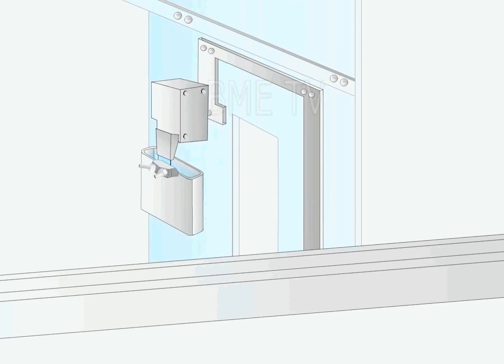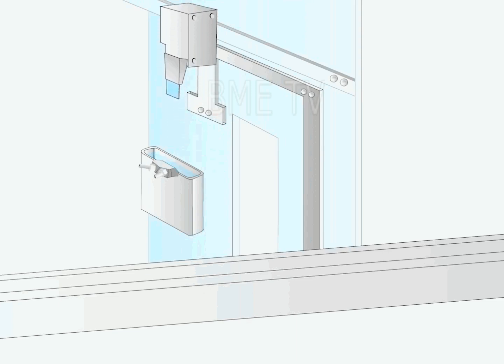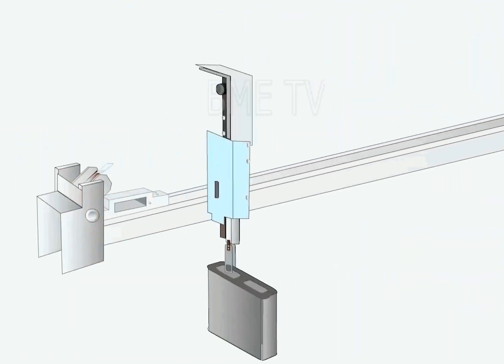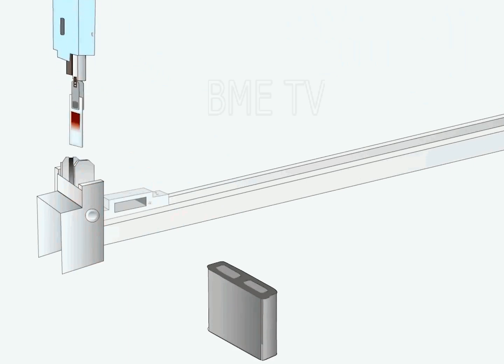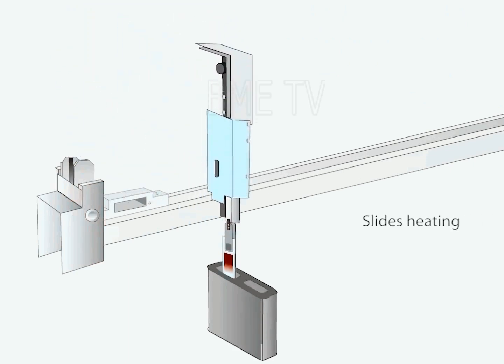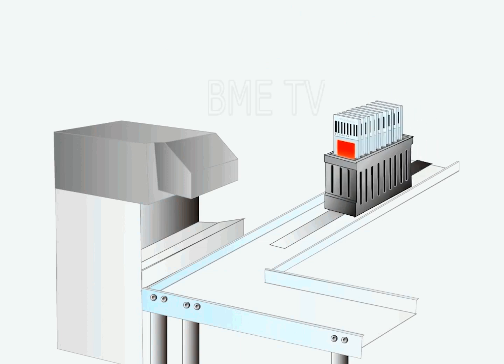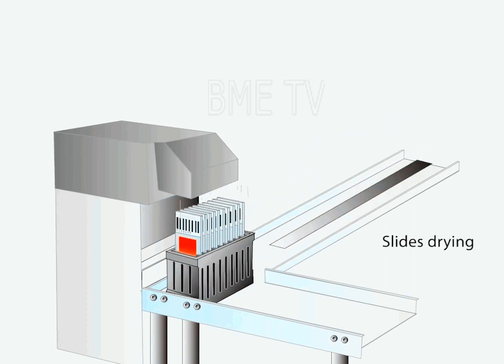The slides are protected from evaporation and drying with various techniques, including covering slides with other slides, cover tiles, or liquid cover slips. In general, there has been a move from the large batches of slides in the past towards smaller batches and even single slide processing. Some vendors consider small trays of 5 to 10 slides to be optimal because multiple stains from the same case can be grouped and are typically released to the pathologist at the same time.